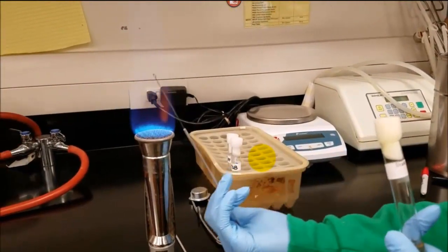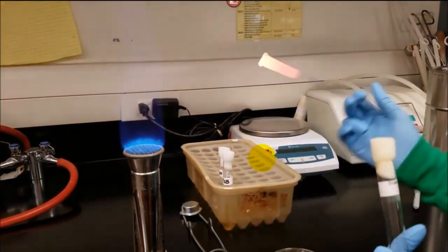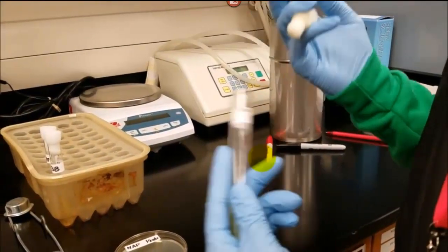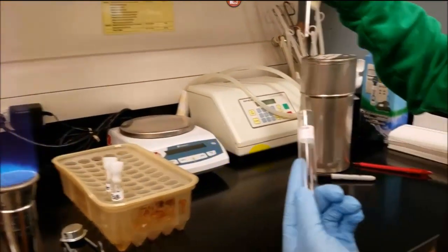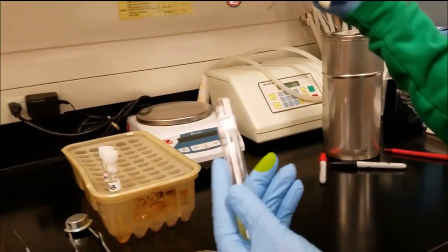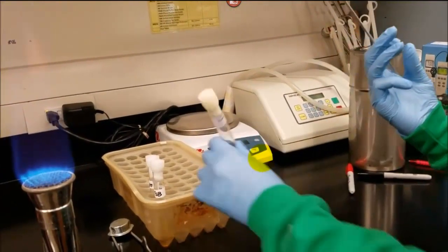Now she is going to transfer something from a broth culture to a nutrient agar plate. And we use those as well. We also use something called tryptic soy agar. So it looks like here she's going to do the tube probably how we would do it. There's a couple of swipes. You don't want to break the glass, of course. Now she's going to take the culture out. She's going to heat the barrel, good aseptic technique. Put the lid on there.